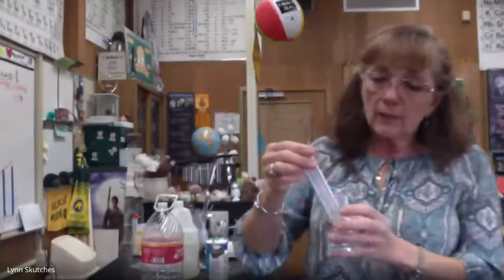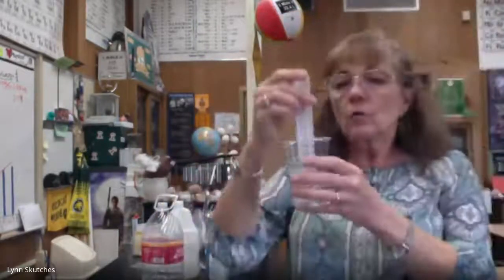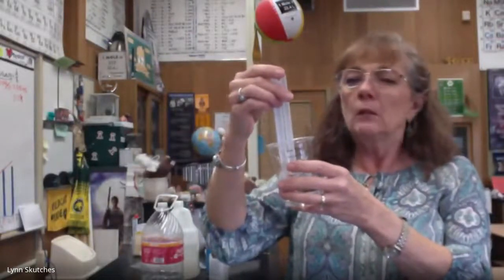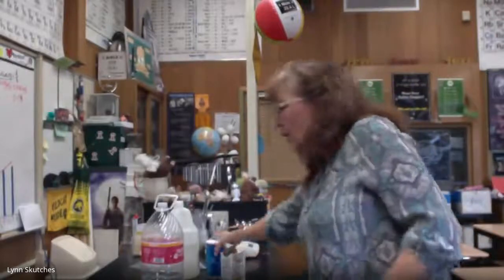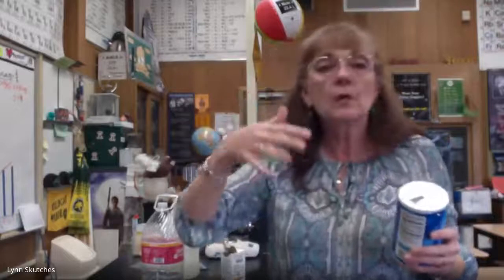And again, these thermometers aren't the best, and they're a little bit hard to read. But you might notice as I change the angle, you can see the red line better at a certain angle, like right there. So just make sure that if you look straight on and you don't really see it, just kind of turn it at an angle. I'm reading... my bad eyeballs, I need to go to the eye doctor. 18, it's between 18 and 19, so I'm going to call it 18.5 for my starting temperature of the water. And then what you're going to do, if you have a measuring teaspoon or a half teaspoon, use that.